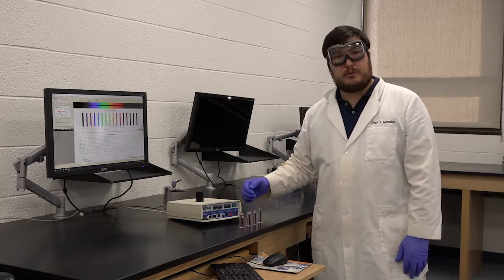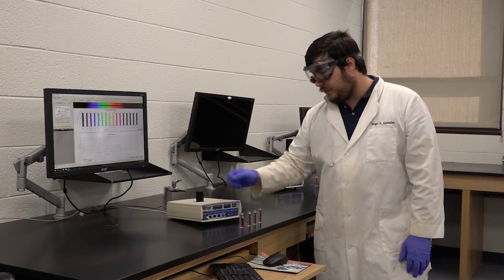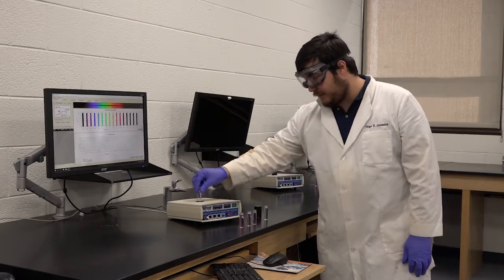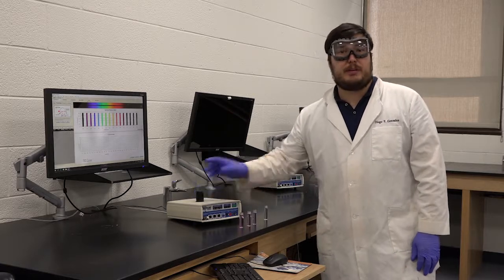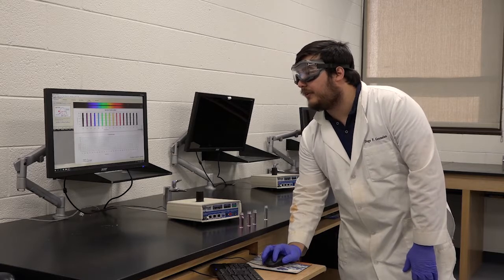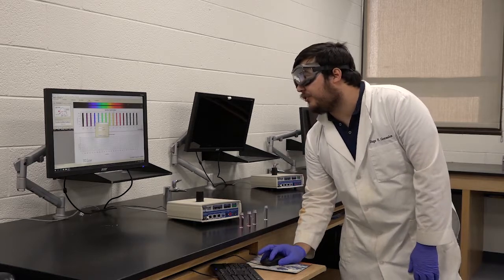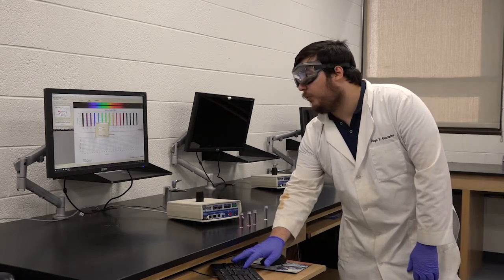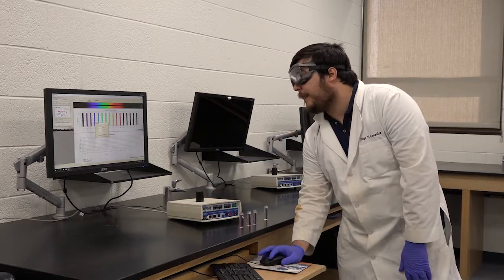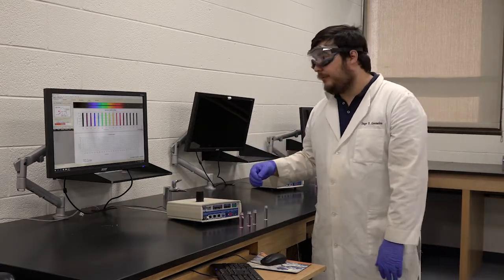So we start with the samples that we previously made of concentrations from the first, second, third, and fourth. We go ahead and take our shield off, remove our blank, and add our first concentration sample. This is denoted in the table that you see in your lab report as far as the concentrations and volumes are concerned. We're going to hit the add button, and on the sample ID we're going to hit 1, and for our concentration of volume we're going to put 1, since we're going to start with sample 1, 2, 3, and 4 as increasing in concentration. Let the spectrophotometer go ahead and read that data, and then we're going to start with the second one.